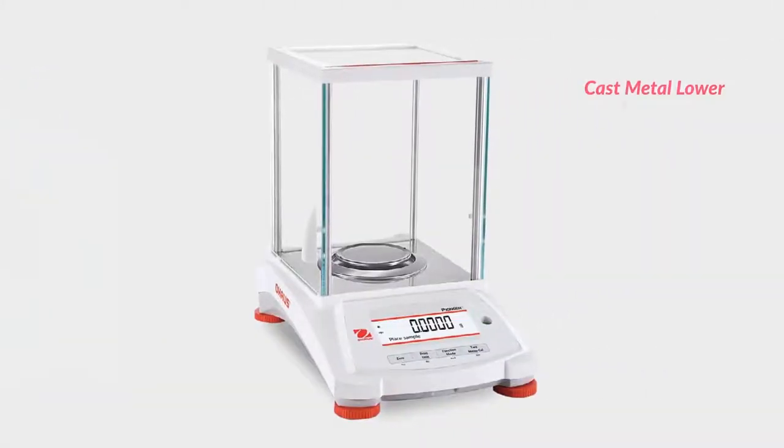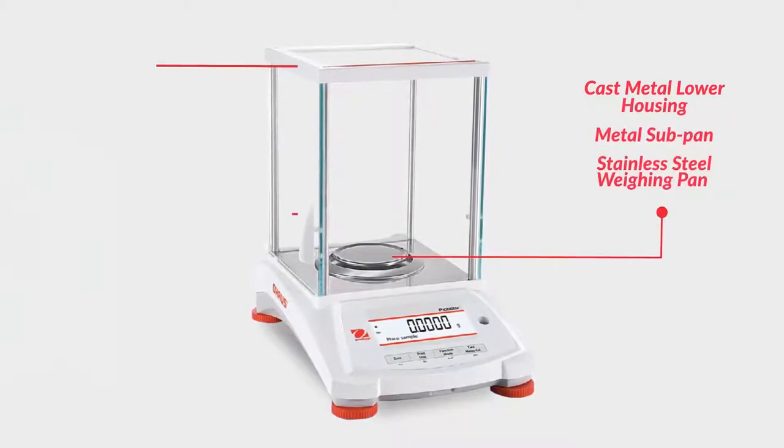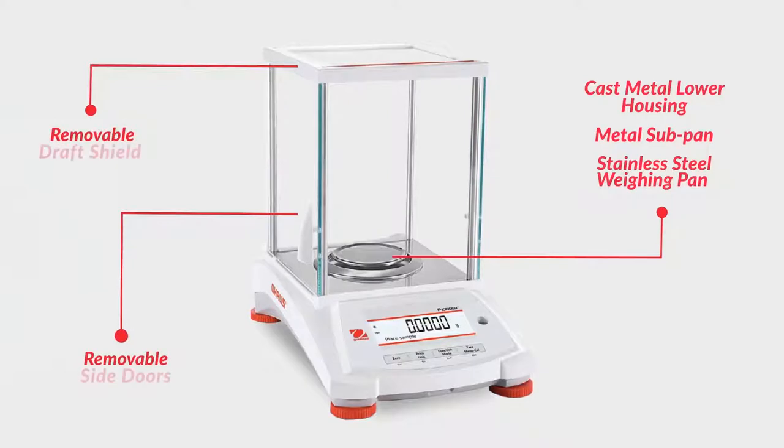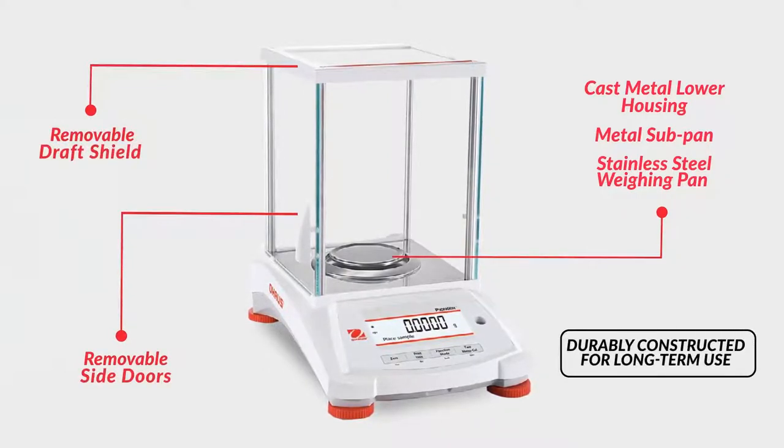Featuring a cast metal lower housing, metal subpan, stainless steel weighing pan, and removable draft shield with side doors, the Pioneer PX is durably constructed for long-term use and suitable for a variety of applications.